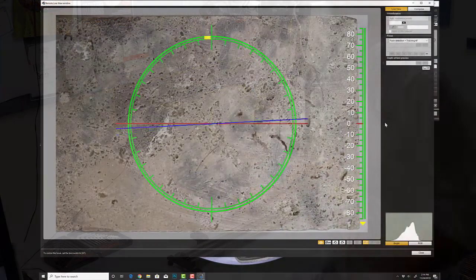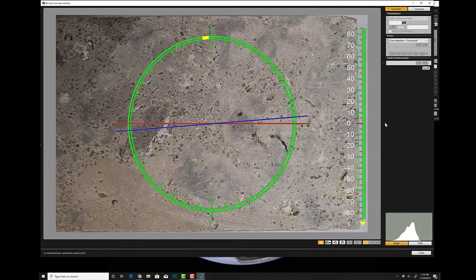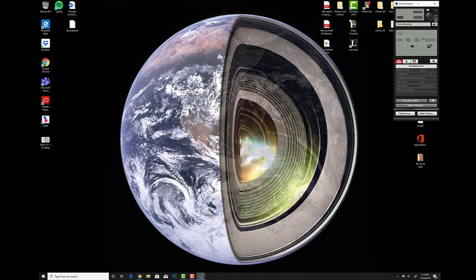The next thing you want to do is close your live view on the screen. And what we want to do is take the camera so that it's back on its manual mode. Manual is going to allow us to achieve the desired settings that we want. Generally when you're shooting macro, and in all cases with the 100mm and the MP65, we want to use an exposure of 1/200, an aperture of f4, and an ISO that's low, so between 100 and 1000, but if you can get it under 500, that's even better.